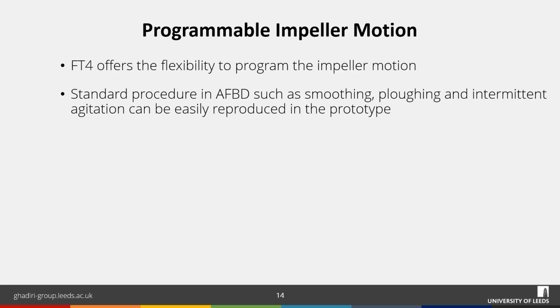The FT4 rheometer offers the flexibility to program complex impeller motions. Using it, we are able to reproduce standard procedures in AFBD, such as smoothing, plowing, and intermittent agitation in the prototype.